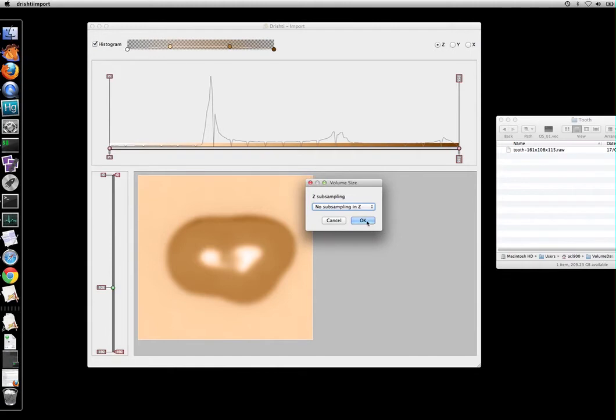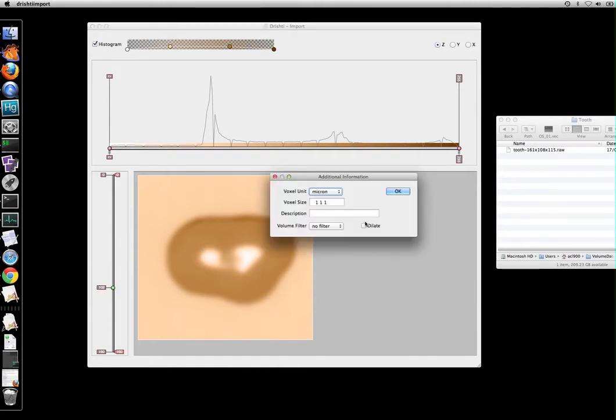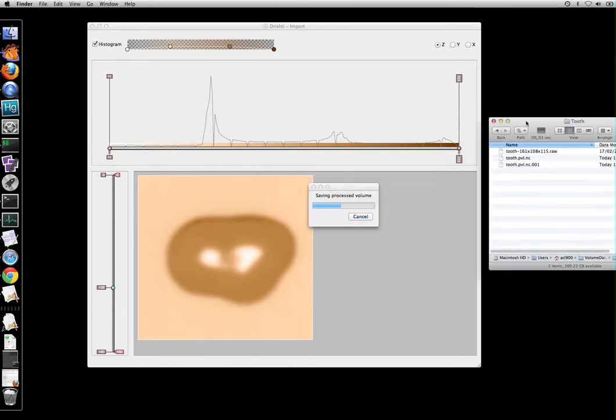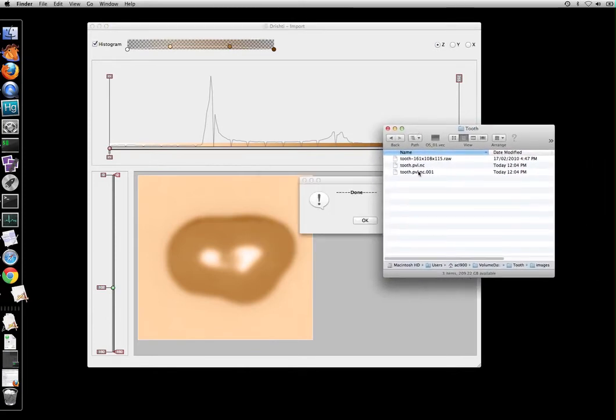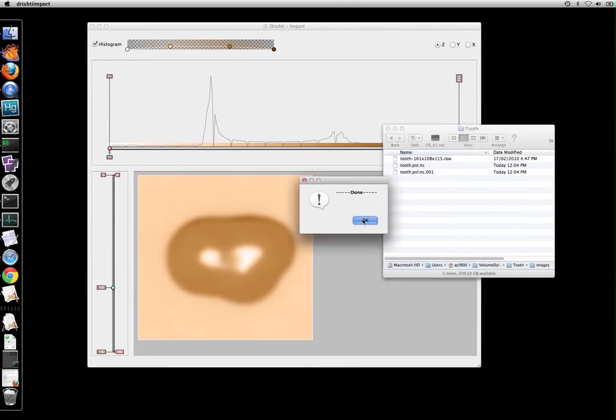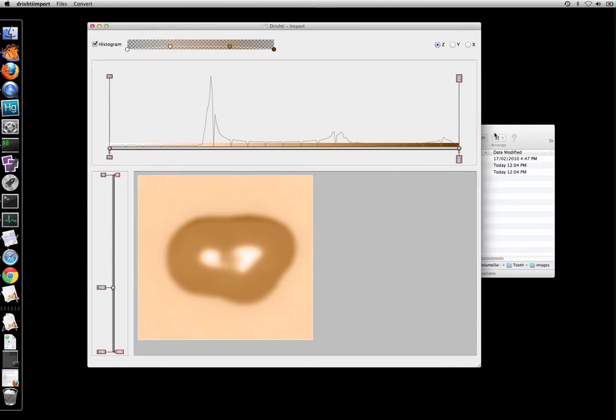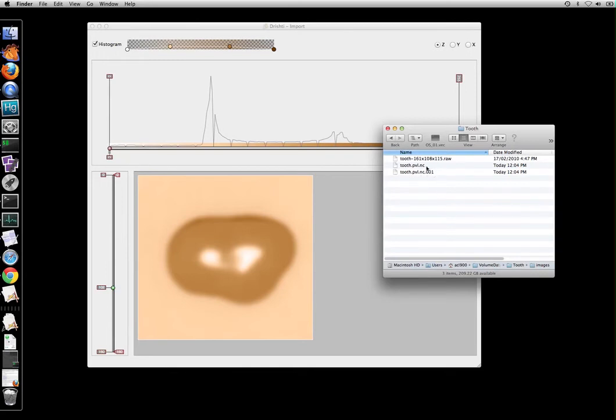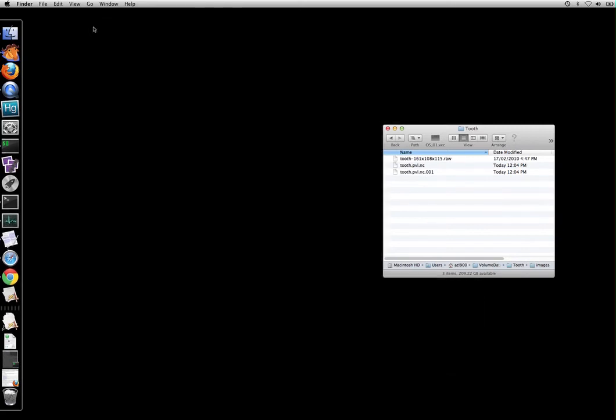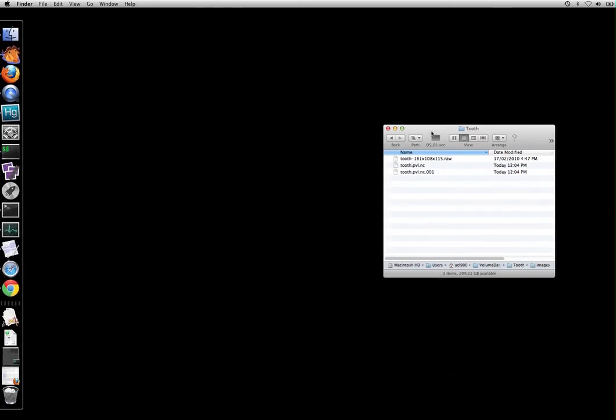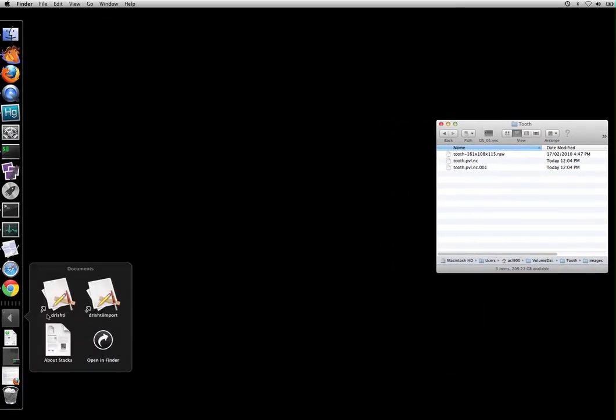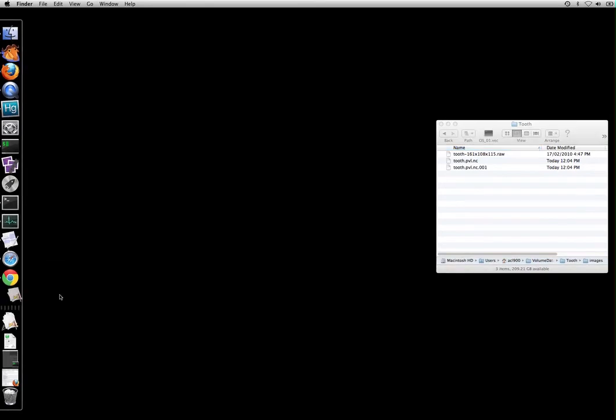We also don't want to subsample in Z and XY and we will just accept these default values. So once this is done these files are created here: tooth.pvl.nc and tooth.pvl.nc.001. Your actual data is in these 001, 002 files and pvl.nc has got links to these files here. So let's kill the importer and let us run the render.